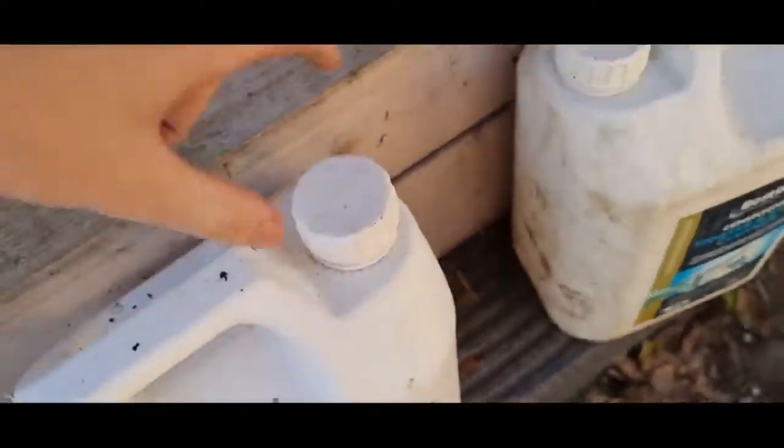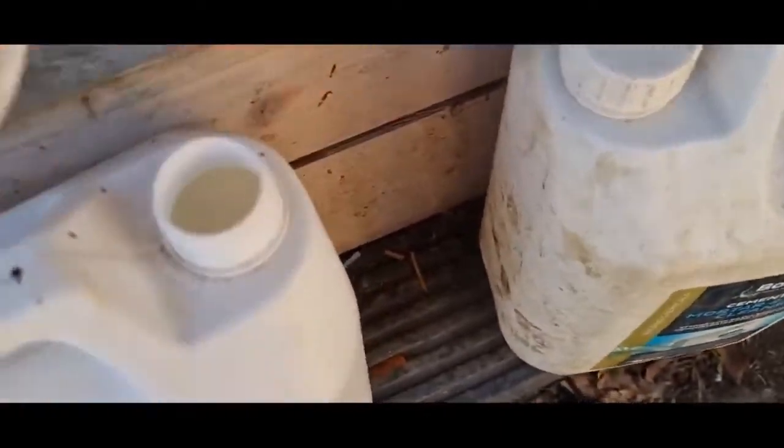Hello, welcome back. Today we'll be getting rid of my copper chloride, so we'll be refining the copper out.